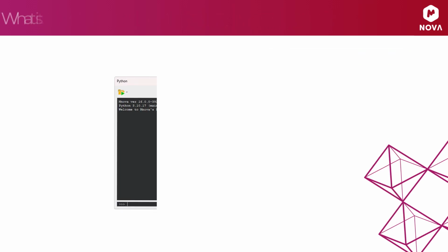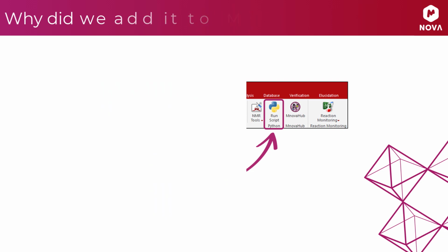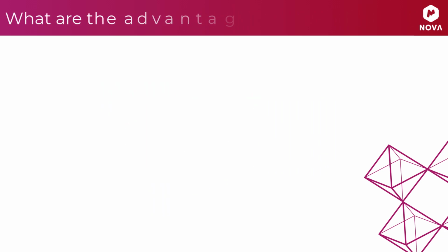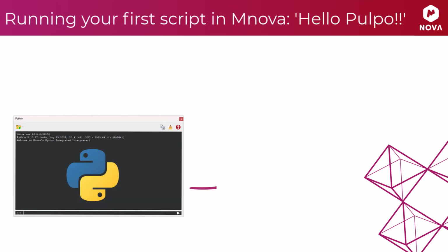In the series, we're going to explore what the Python engine is, why we are adding it to Mnova, and what advantages it has over the old JavaScript engine. We will then take a look at running our first Python script in Mnova, Hello Pulpo.